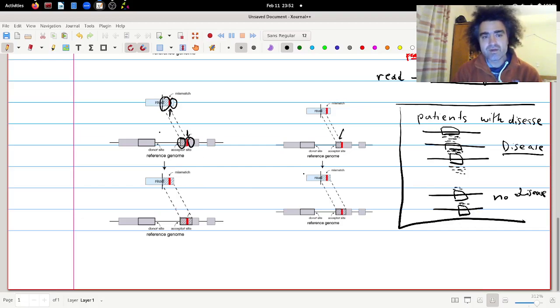And then what it will do is that it will try to cluster, it will try to merge again this information here, saying, okay, I have 2 matches of one read that are not very far away, so then maybe they belong to the same gene. And if this will match with the annotation of the genome, then it will count this as a read that matches to the gene, and that's how it will find the expression level of the gene.